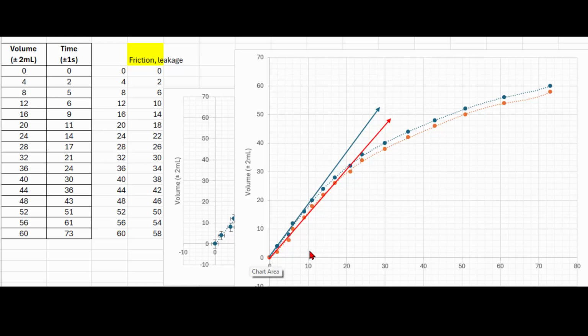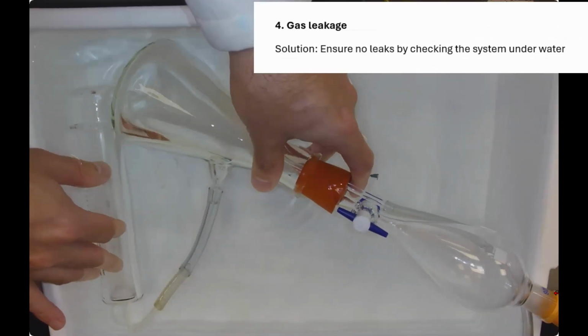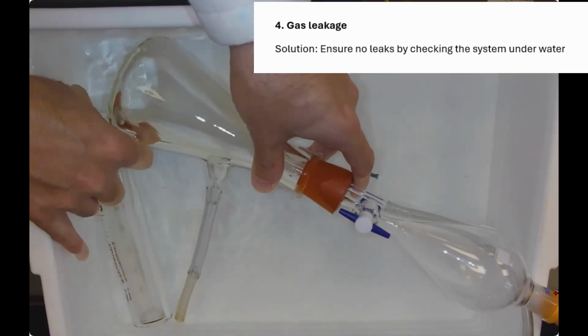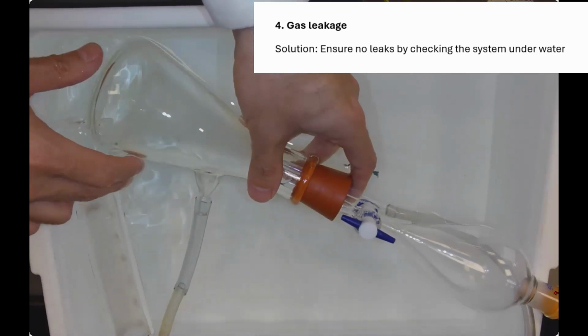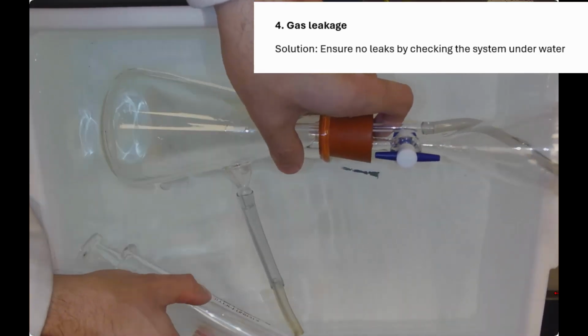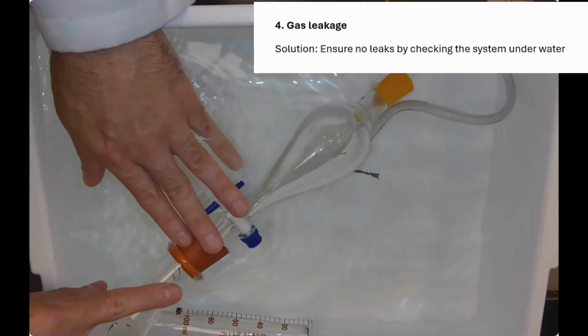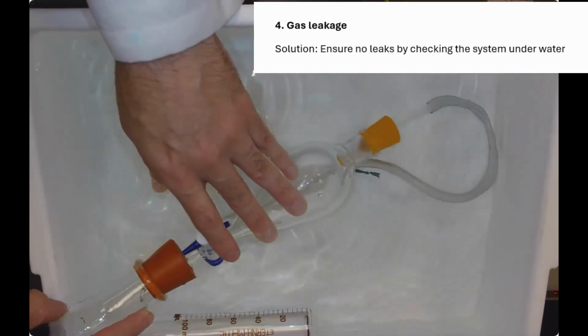I'll look at leakage next, and that'll be the same graph, the same deal, so I won't go back to these graphs for that. You can see again that'll be less volume than what you should get, so the initial rate will be lower again. So it's by looking at the data that you're going to match it to which method error it might be and how to improve it. As I just mentioned on the previous data, gas leakage may look the same as either friction on the plastic syringe, or perhaps even a badly designed glass syringe, not a good quality one, or the vapor collecting over water where the gas is getting dissolved. So just less gas in the system than you would expect.